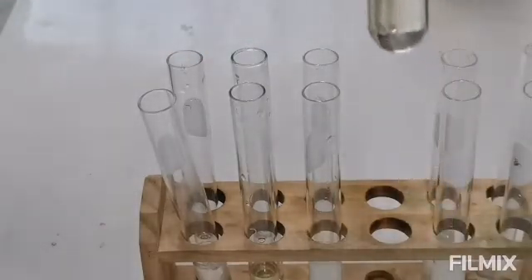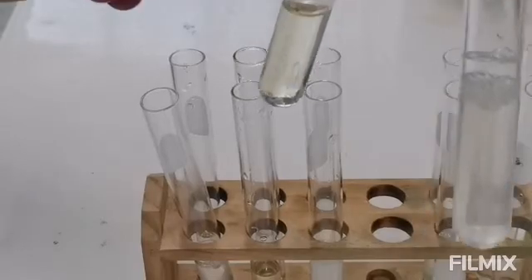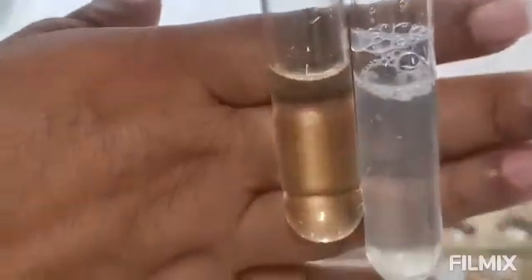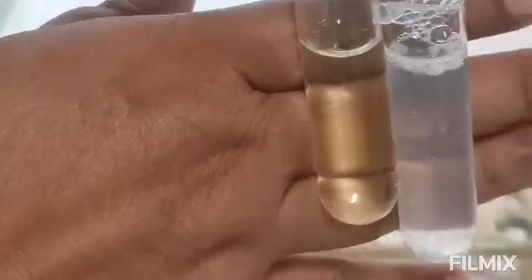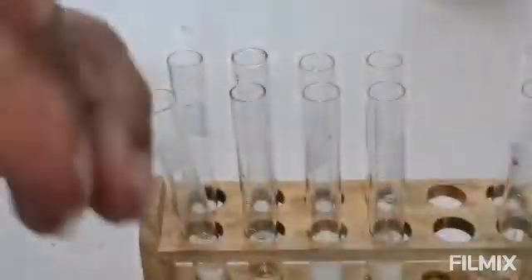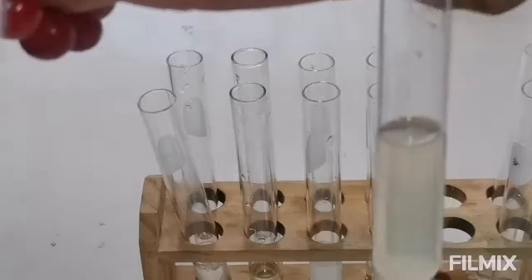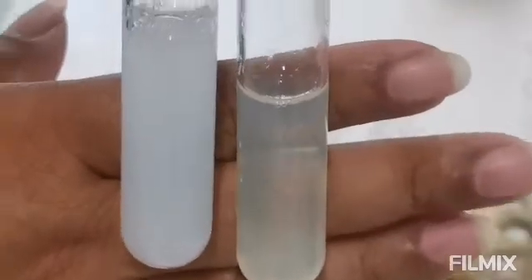This is the beef extract. And this is your egg albumin. This is after the addition of ethyl alcohol. So again, can you see the difference? And this is your albumin after adding silver nitrate. And this is your beef extract after adding silver nitrate. So you could see again the difference.